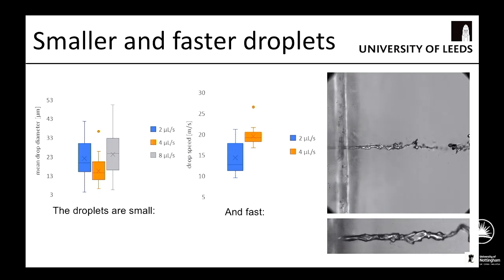So this means that we can now get down to time frames of around 6 milliseconds. 2 milliseconds is the fastest we can go at the moment, and that's limited purely by the speed at which we can move the plunging arm. So hopefully by the summer we can increase the speed of the plunging arm and we can go sub-millisecond into microsecond, being able to make these grids.